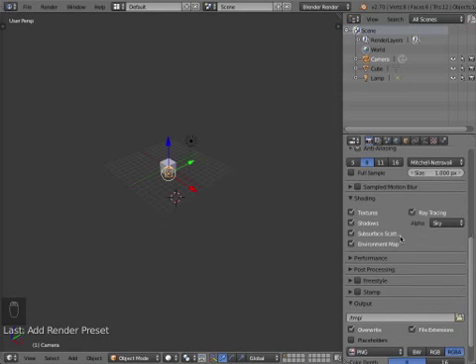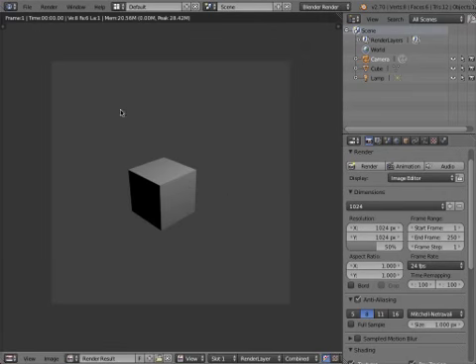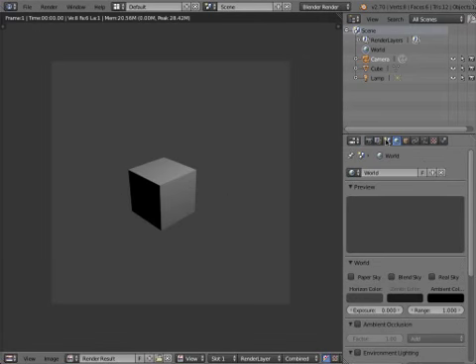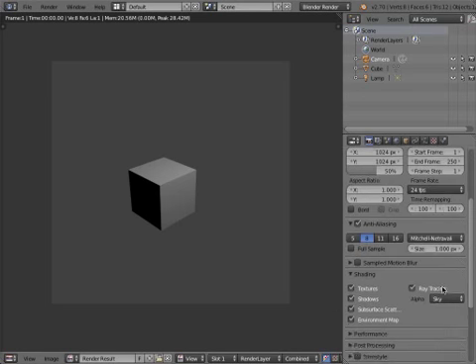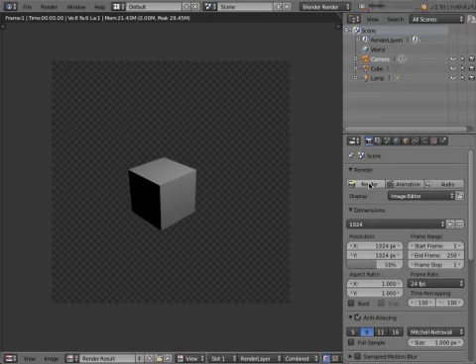With the shading, there's one very important thing, and that's alpha. So alpha is a transparency channel, and it's right now set to sky. So if I go and render, you'll see I have a gray background, because if I go into the world, gray is the sky. But mostly when we're working with this kind of data, we want it to be transparent. And if I now render out, you'll see there's no background. So that checkered thing means no background.